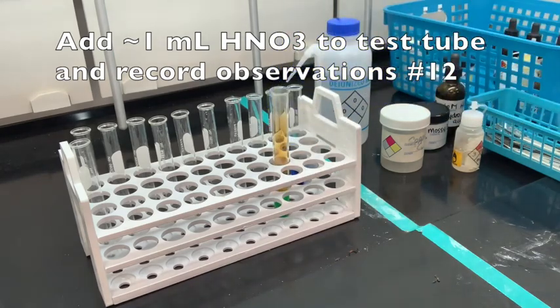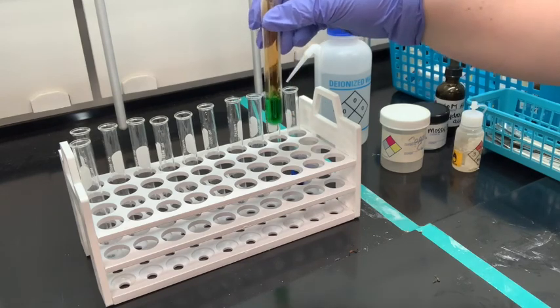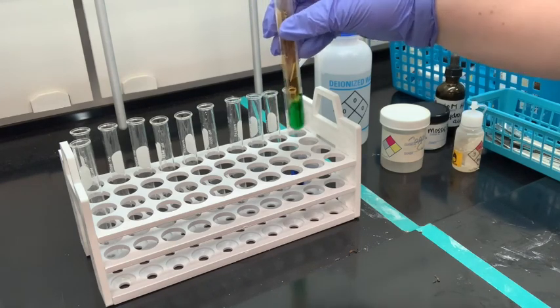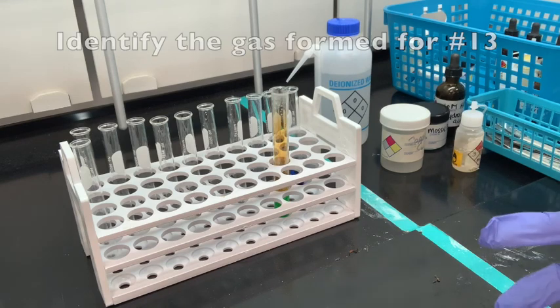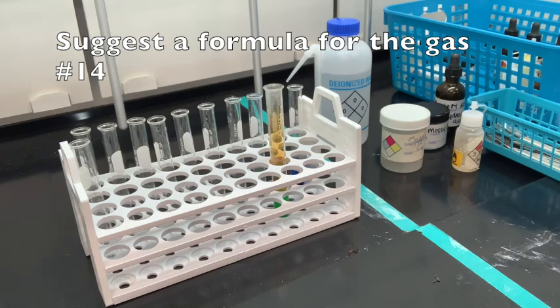Okay, so think about those observations there. We are not going to observe the odor of this because this gas is actually toxic, so we don't want to breathe it in. Another reason why we're doing this inside the hood. But you need to be able to identify what this gas is. So looking at its color, knowing that it has a pungent, toxic odor to it, because I'm telling you that, you can use the table that is on page 58 to identify what gas comes off of this reaction. So number 14 says to suggest a formula for the gas. So again, using page 58, identify what that gas is.